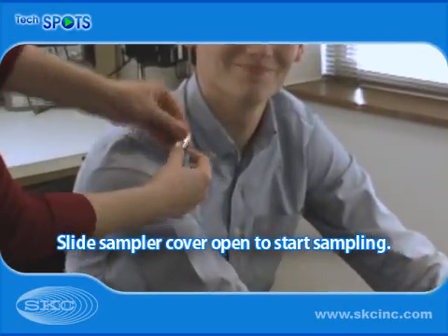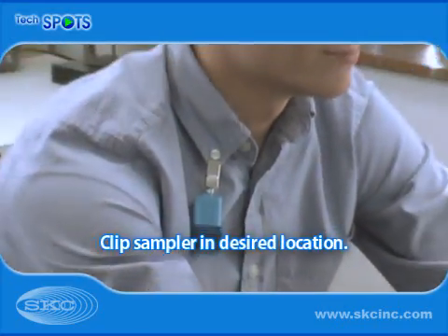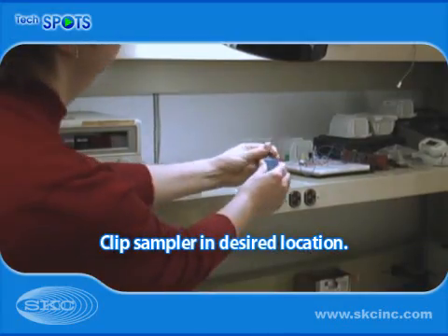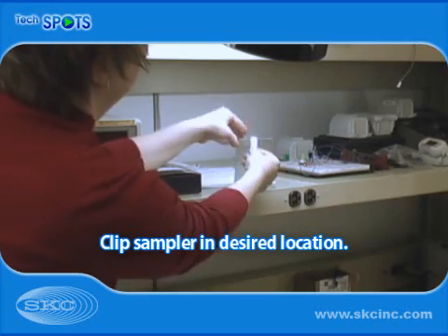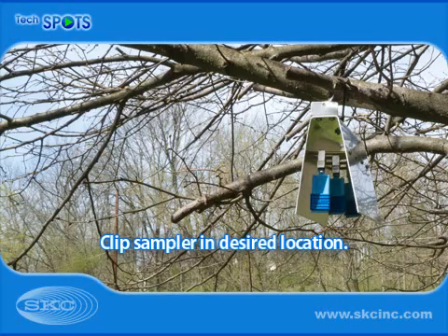Slide the sampler cover open to start sampling. For personal sampling, clip the sampler to a worker's collar. For indoor sampling, clip the sampler to the stand accessory at breathing zone height. For outdoor sampling, clip the sampler inside the shelter accessory and hang at breathing zone height.